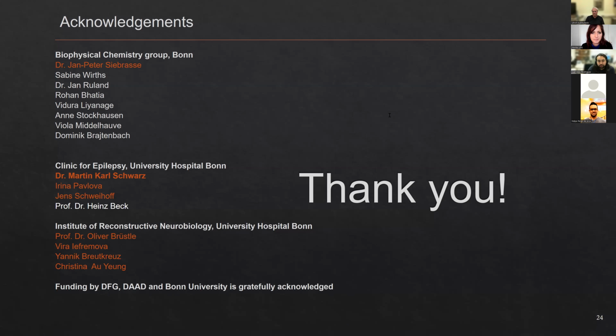So what we are doing is actually normal antibody staining. There is nothing special. We use commercially available antibodies. So if you do your staining and it looks good in the confocal, I'm sure that it will look good under the light sheet microscope.